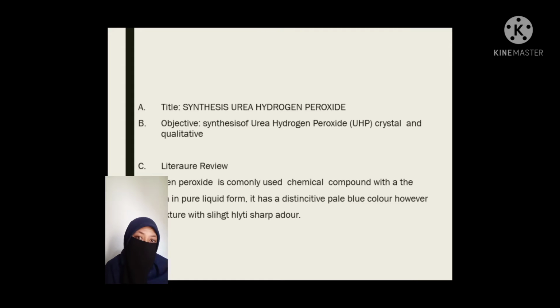Literature review. Hydrogen peroxide is a commonly used chemical compound. In pure liquid form it has a distinctive pale blue color. However, in a mixture with urea, it has a less harsh odor.